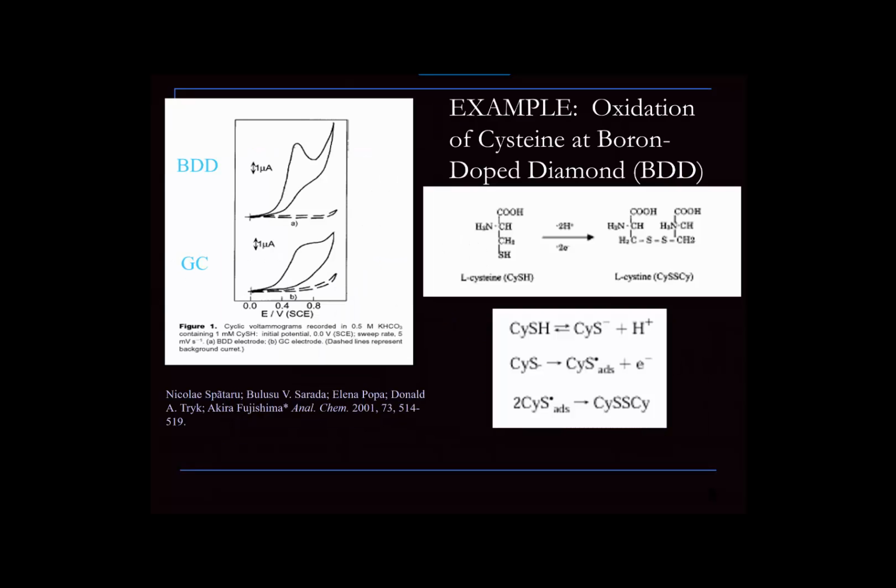On this slide, I wanted to give you another example from biochemistry of a system that doesn't undergo reversible voltammetry. So the small amino acid cysteine, L-cysteine, shown at upper middle, it can be oxidized. It can lose 2 protons and 2 electrons. And when it does, it tends to form this dimer product, cystine, which is shown at right, has a sulfur-sulfur bond, and that is irreversible voltammetry.